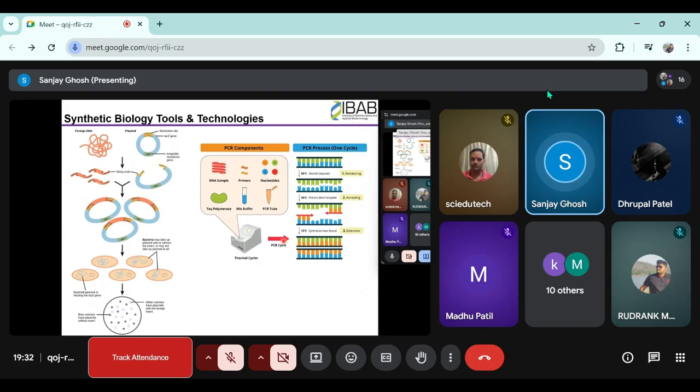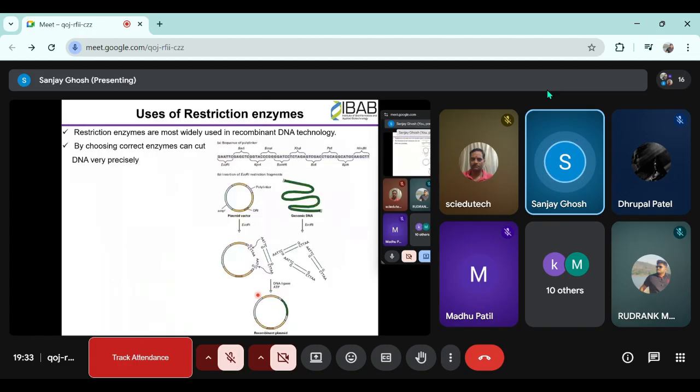That PCR is nothing but you need three different steps. You need primers, and these are commercially available. You can buy them. So what is variable is the DNA sample that you put, and what is variable is your primer, because the primer will depend on the DNA sample. The rest remains the same in all PCR reactions, right? So this is the take-home message.